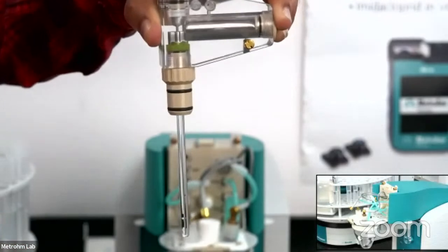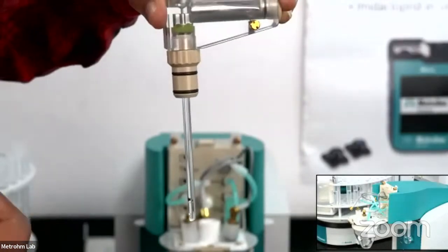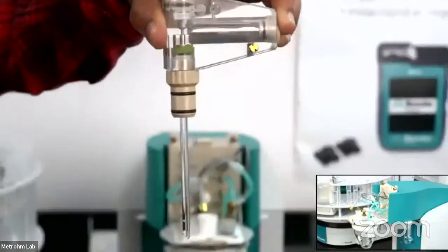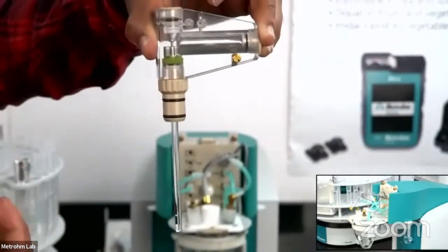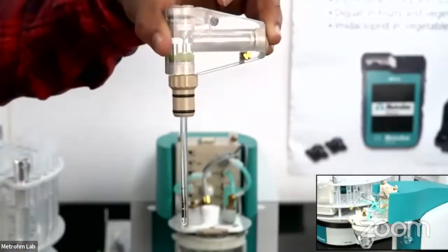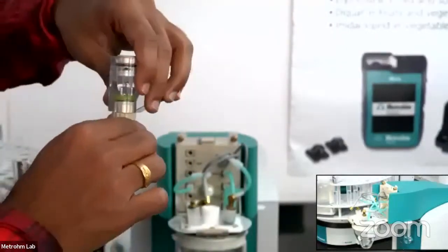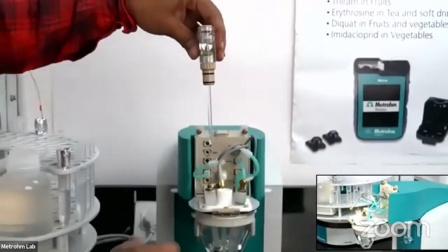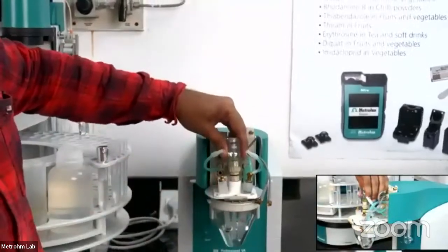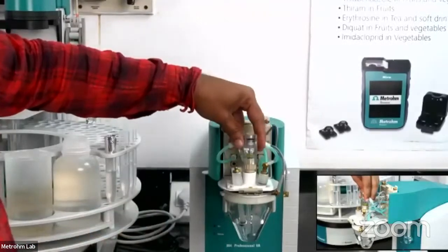In case of DME and SMDE mode, the mercury drop falls continuously based on the tapping, which is generated using the electromagnetic effect in the system. That gives you the liquid state electrode. Every time a fresh, new drop will be formed, and this will be used for higher concentration analysis. Normally in HMDE, we perform PPB or PPT level analysis. When we do analysis at higher ppm level, about 10 ppm, we can use even SMDE or DME for the analysis.